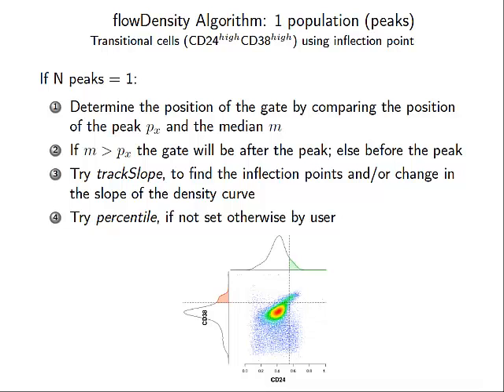And what we've tended to find, if you're trying to do discovery, is you'll find something, unless it's Parkinson's disease, where we didn't. But generally, you don't care what it is, and if there's only one population in there and it's a rare population, you're probably hooped. If that's the only thing that's going to be in your discovery, and you don't know what it's going to be, you're probably not going to find that. You're not going to find that by hand, and you're not going to find that with an automated method.